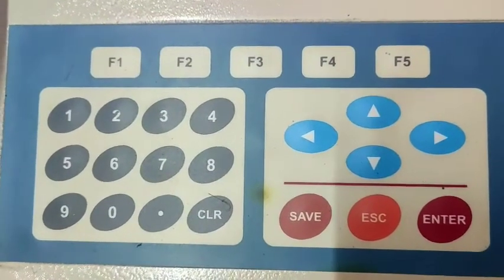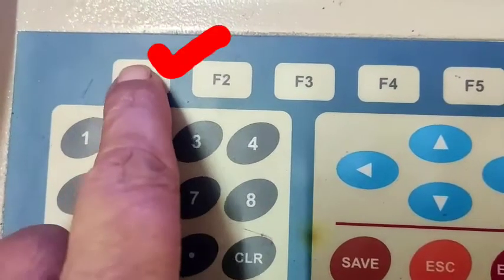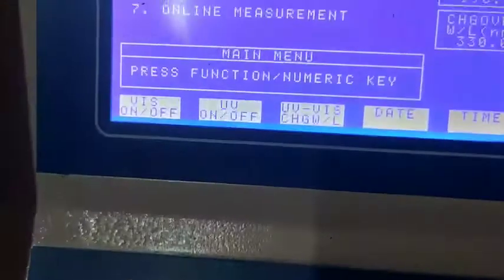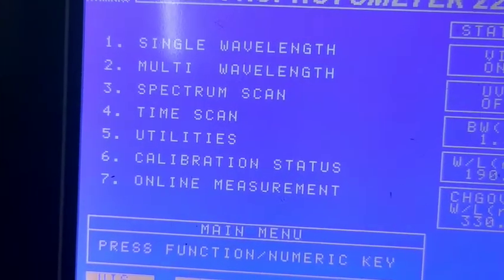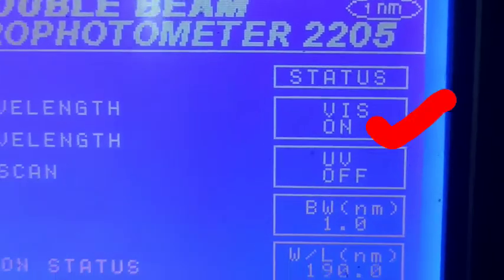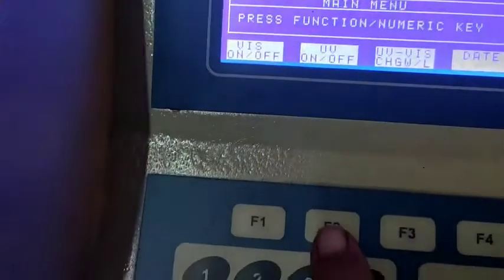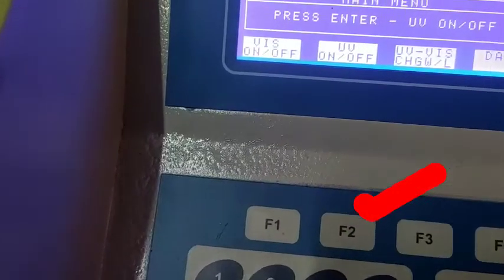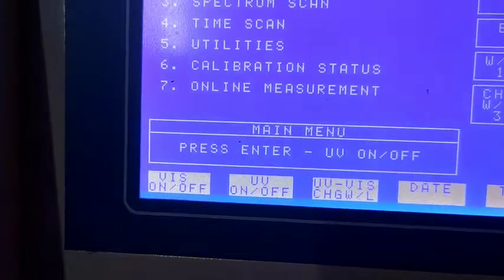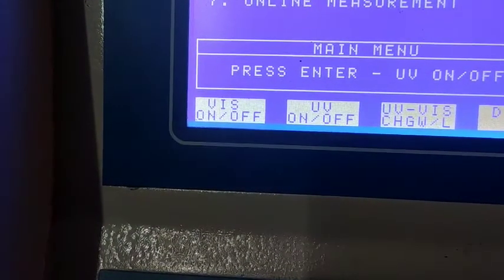There are numeric keys and on the right side you can see right, left, top, down, save, escape, and enter keys. If you press F1, it corresponds to the visible lamp — you can see the visible lamp on status is showing 'visible lamp on.' If you press F2, it takes time to get started because F2 corresponds to UV on/off.